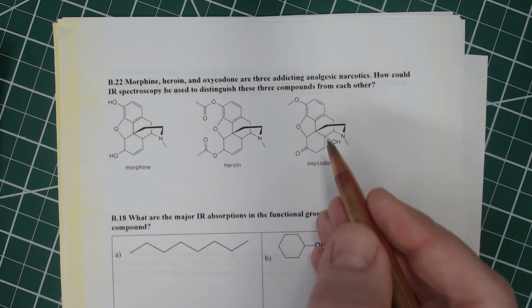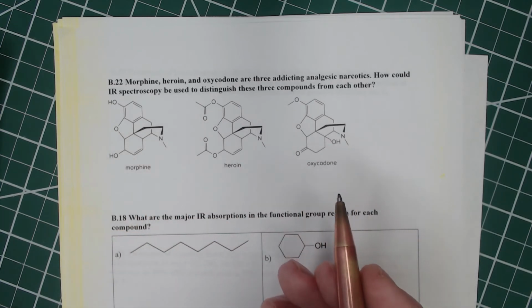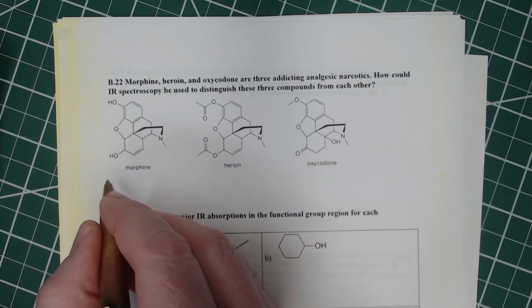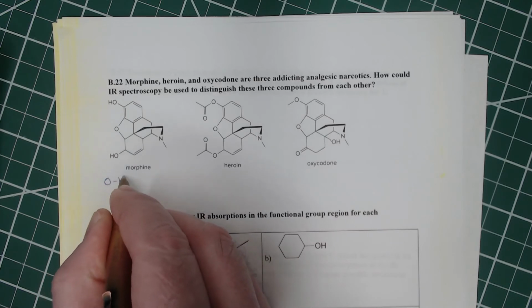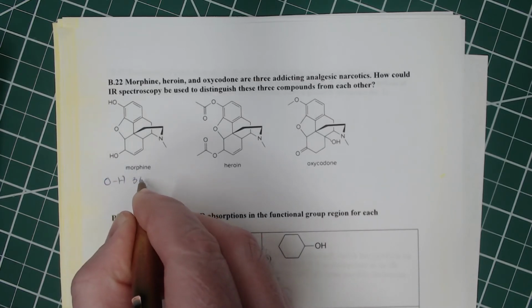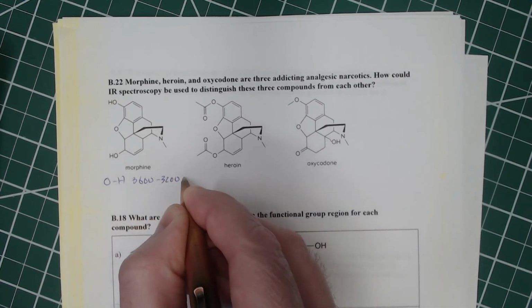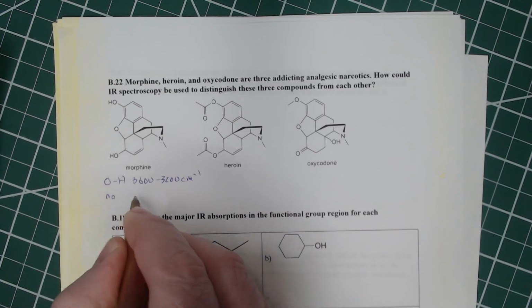They all have a phenyl group. They all have carbon-nitrogen bonds. None of them have nitrogen-hydrogen. So this one will have an OH peak. And again, that's at 3600 to 3200. All right. And it'll have no carbonyl.